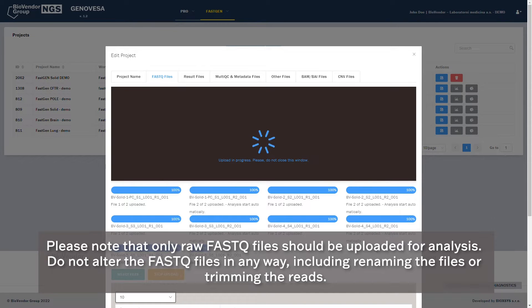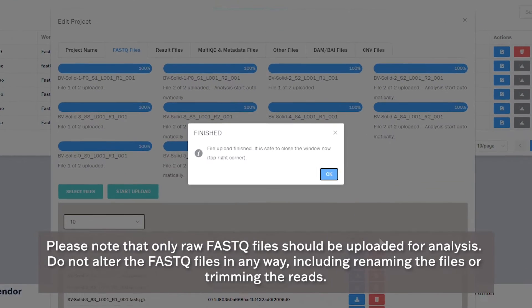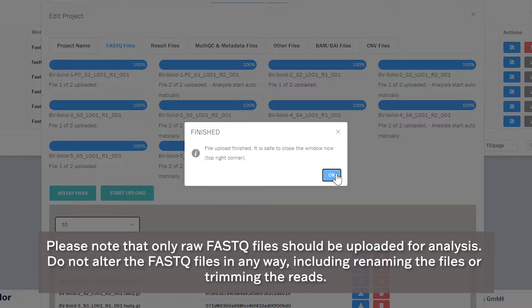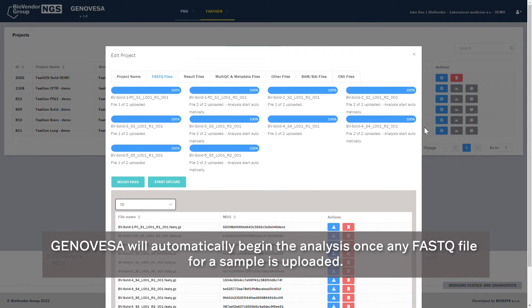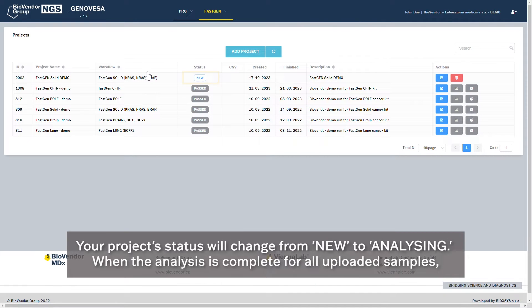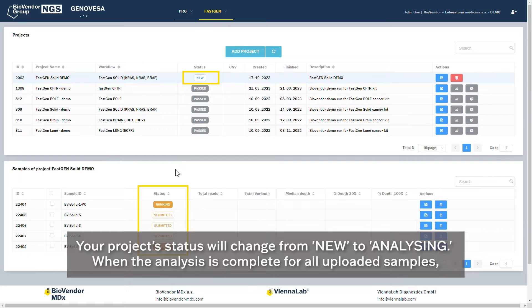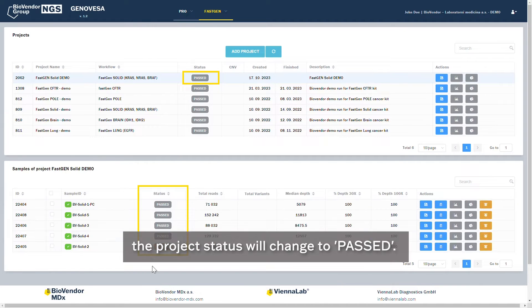Please note that only raw FastQ files should be uploaded for analysis. Do not alter the FastQ files in any way, including renaming the files or trimming the reads. Genovesa will automatically begin the analysis once any FastQ file for a sample is uploaded. Your project status will change from New to Analyzing. When the analysis is complete for all uploaded samples, the project status will change to Passed.